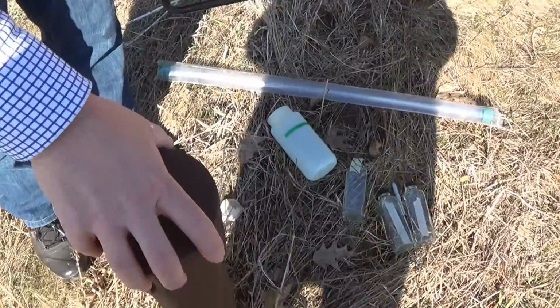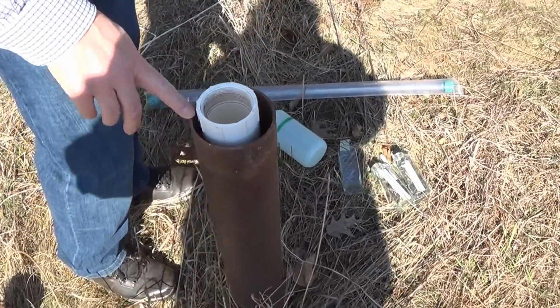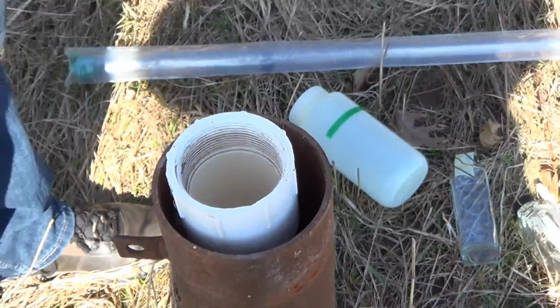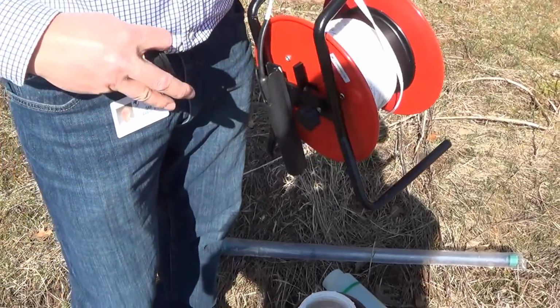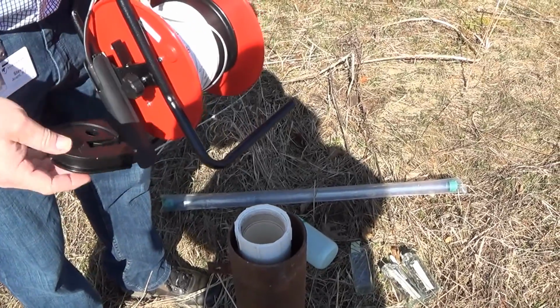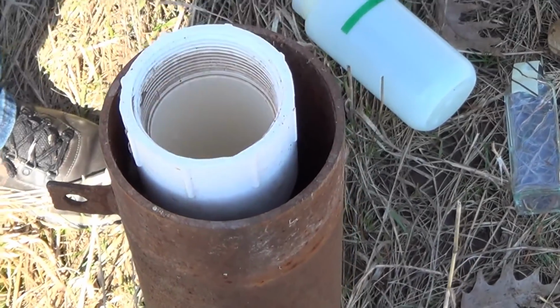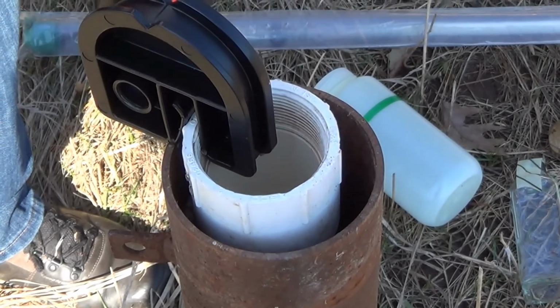So let me open up the well. And what we see here is that there's an outer casing where the 2-inch PVC well was inserted. What comes with this piece of equipment is a little device to assist in positioning this level indicator, and it's intended to be inserted on the metal well casing here. And it looks like we're just not going to be able to fit this on there, but in general it sits off the edge of the metal casing, and we won't be able to get it all the way down here.